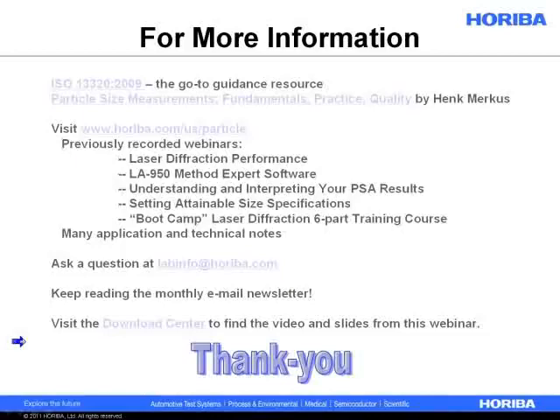The ISO guideline is probably the first place you should look. It's certainly the definitive guide to what makes a good laser diffraction measurement. And it was very recently updated in 2009, so what you should do is look at ISO 13320 2009. Eventually, when you look at the slides on our website, it'll be in a PDF, and all of these areas will be active as hyperlinks. Otherwise, you can just go to Google and type in these same search phrases and get exactly to where you need to go.